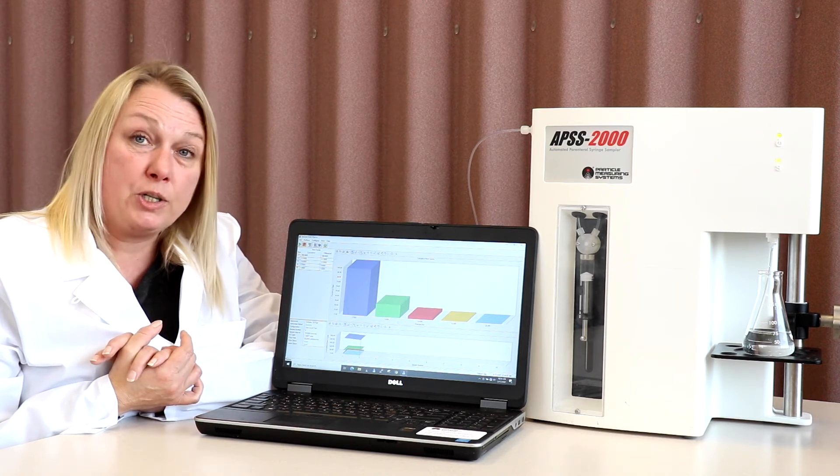If you bring the testing in-house, that cost is going to be much lower. You'll have the instrument, you'll be able to test your samples, and you'll get immediate results.